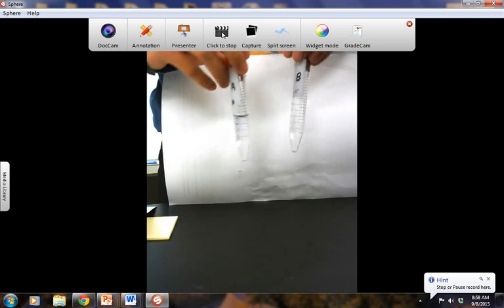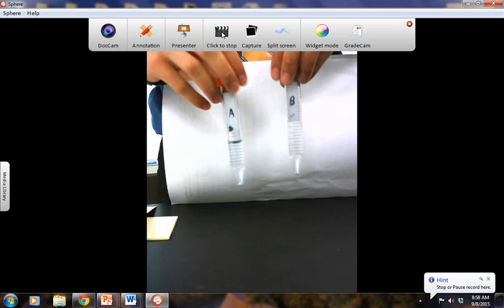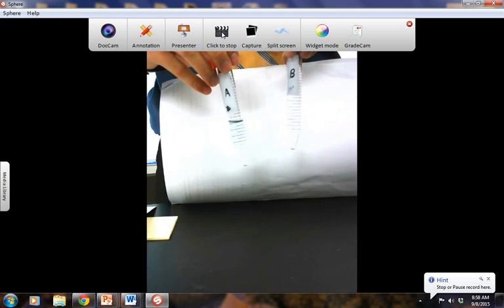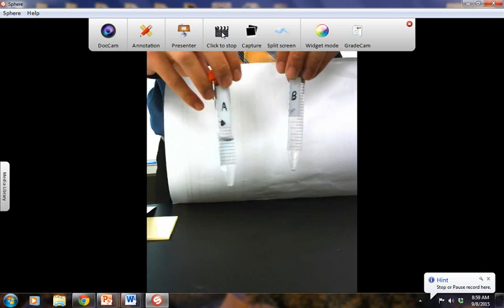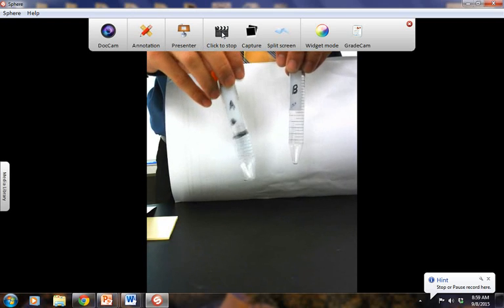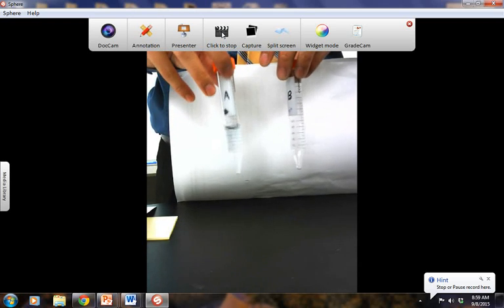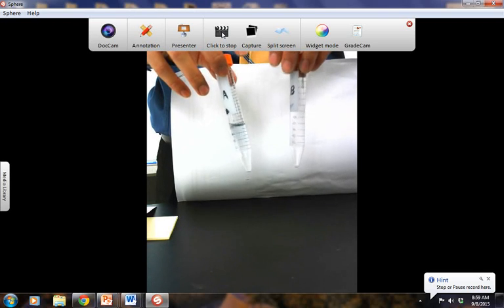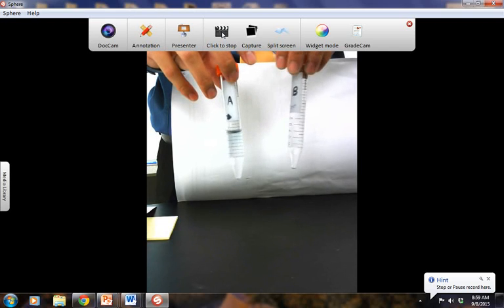Go ahead and take a look at these two test tubes. One is labeled A, one is labeled B. Go ahead and make an observation — write down the similarities and differences between these two liquids. A looks as if it's a little bit darker, but it's actually not. That's just the meniscus. Go ahead and pause it here if you need to take some more time.